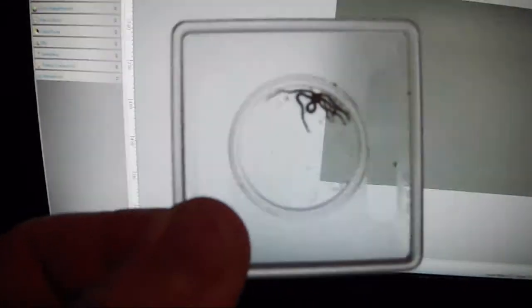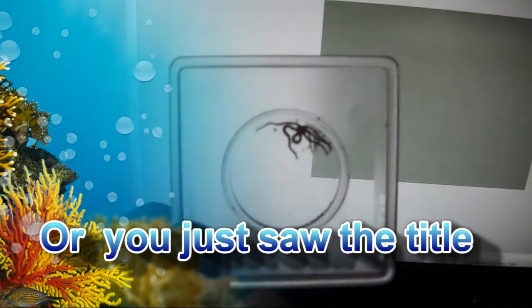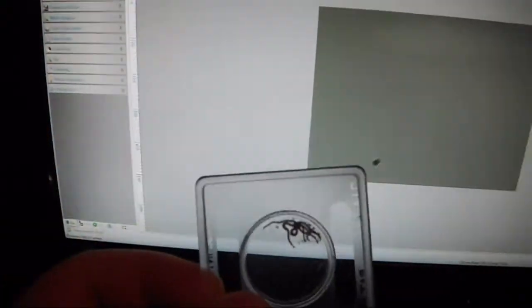Alright, well if you guessed the tube feet of a mini brittle star, you are correct. That's what that was. It's amazing to see those things microscopically and what they can do.